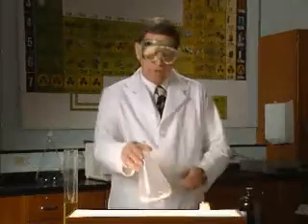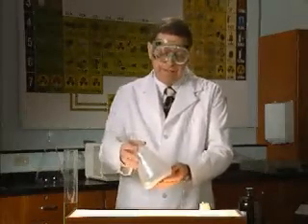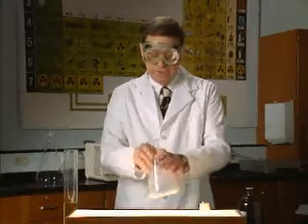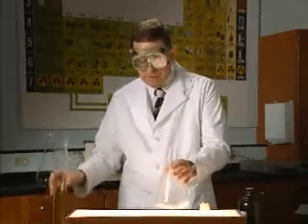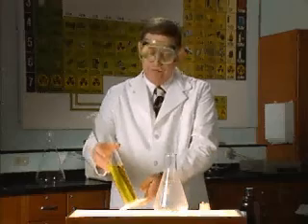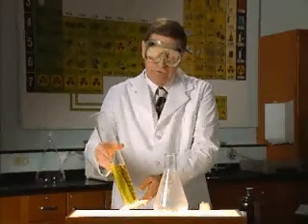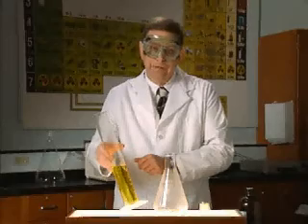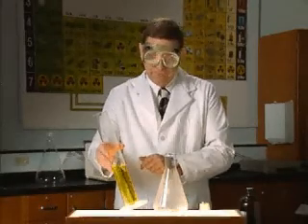Here we've poured off some water from a zinc mercury amalgam and placed it in this large Erlenmeyer flask. Here we have the ammonium metavanidate solution, which we notice is yellow in color when vanadium is in the plus 5 oxidation state.